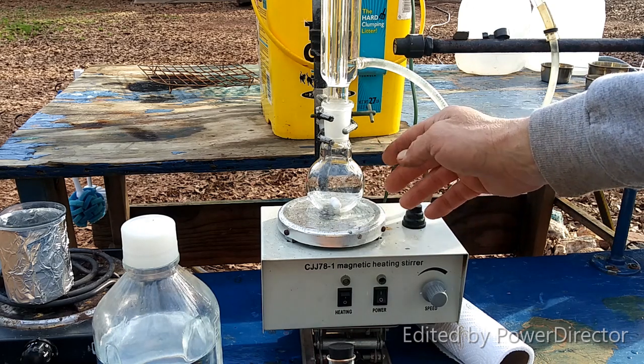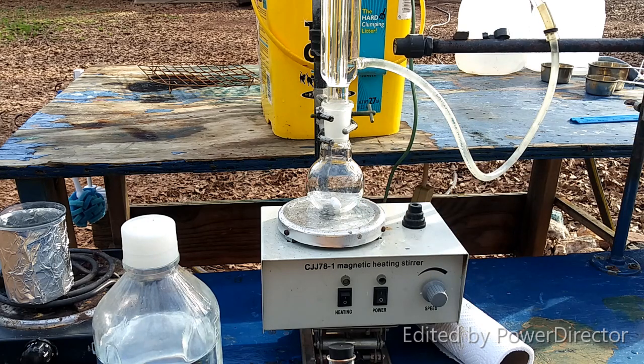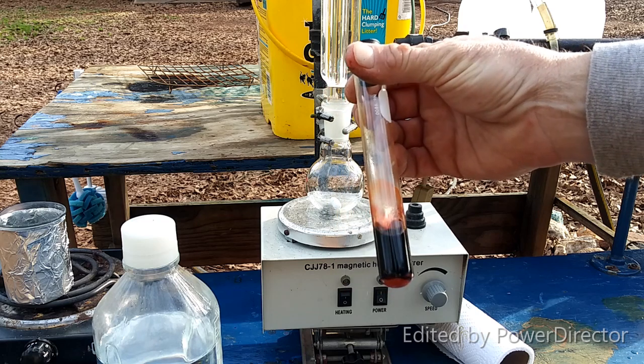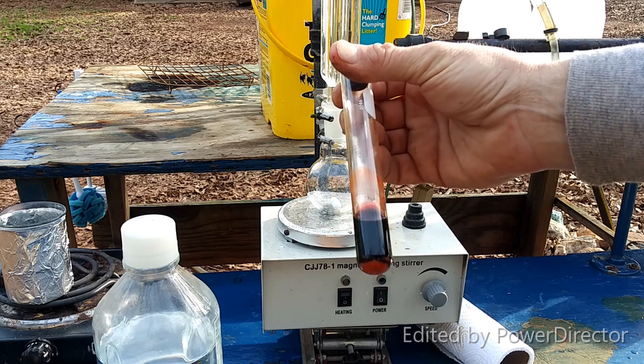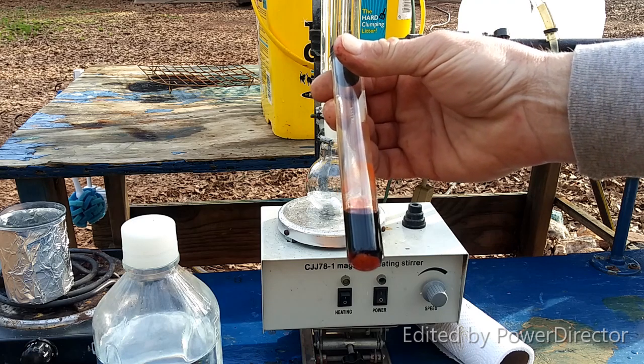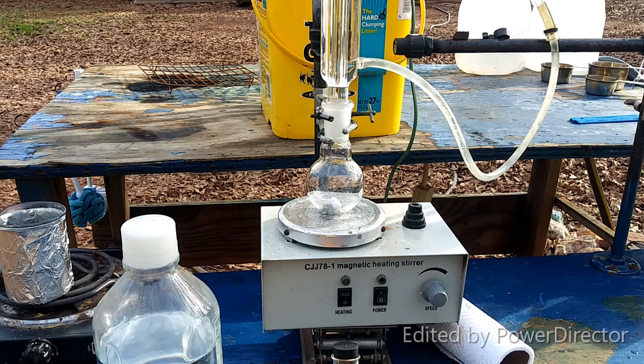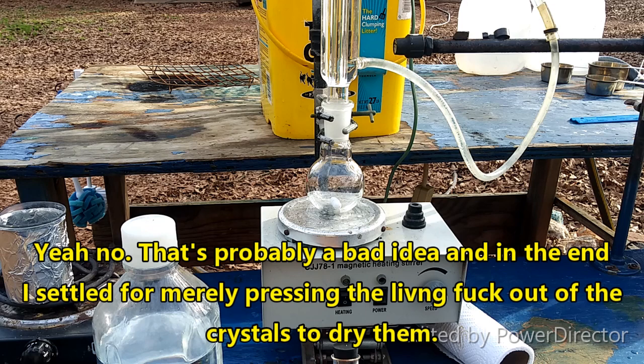We're going to put all that in here, turn on the stirring, wrap this in foil to keep it warm, and then let it go for a little while. It's probably not going to go to completion, but that's fine. Once we've produced a decent amount of it, just like with the antimony triiodide, we're going to take it while it's still hot, filter it as fast as we can, and then we'll have the actual purified crystalline product.